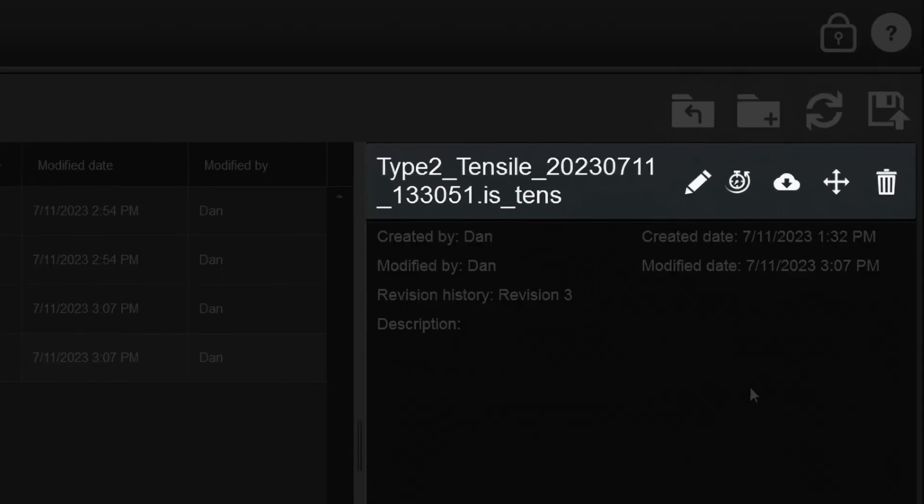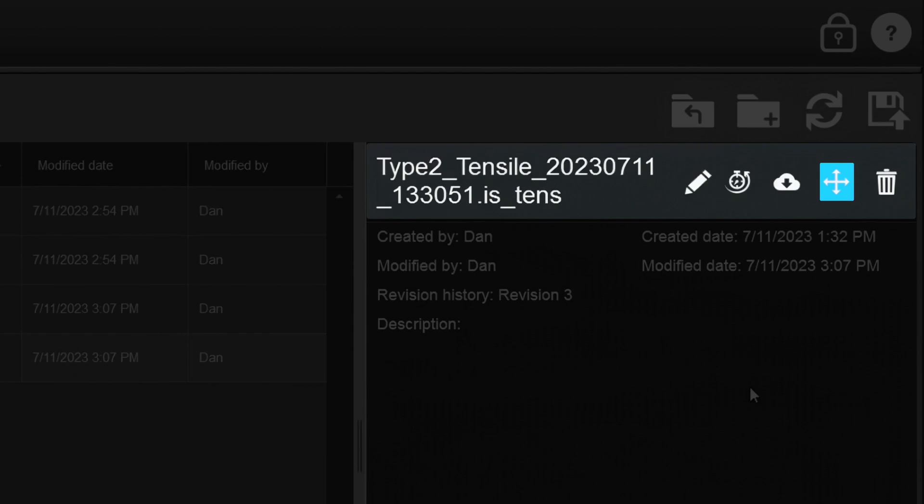Once up and running, the icons in file details allow you to edit the name or description of a file, view revision history for a specific file, and download, move, or delete the file.